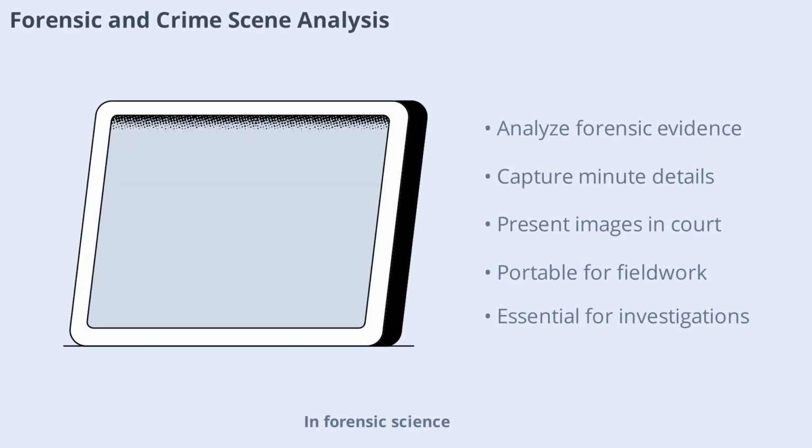In forensic science, digital microscopes are used to analyze evidence such as hair, fibers, and residues. Their ability to capture and document minute details is crucial for investigations. High-resolution images can be presented in court or shared with other experts for analysis. The portability and ease of use of digital microscopes make them valuable tools for fieldwork and laboratory analysis alike.